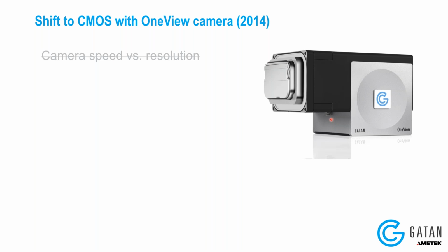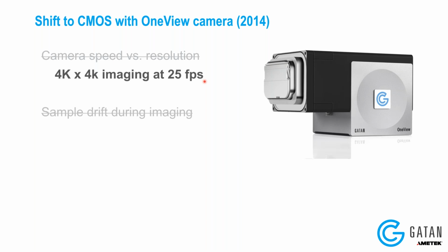The idea that you had to do a trade-off between camera speed and resolution was solved because the high-speed CMOS sensor meant that you could both read out a larger image size, up to 4K by 4K in image size, at a good frame rate of 25 frames per second. And so you didn't have to move back and forth between an imaging mode and a sample navigation mode on the camera. You always had the capability to do both.